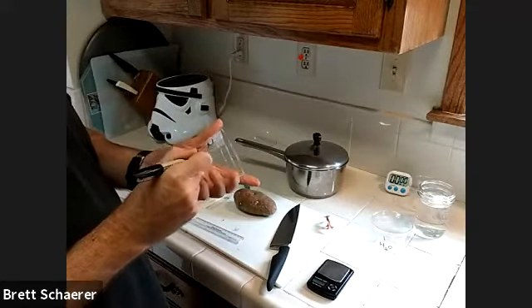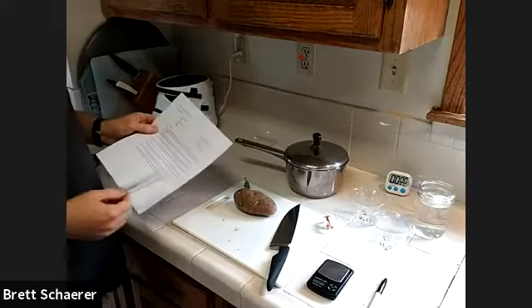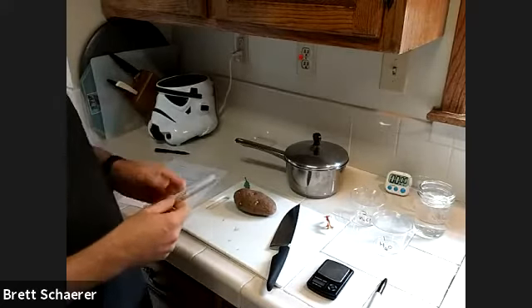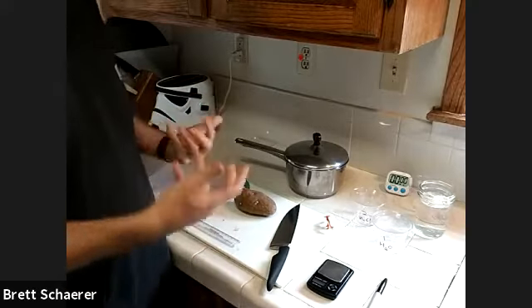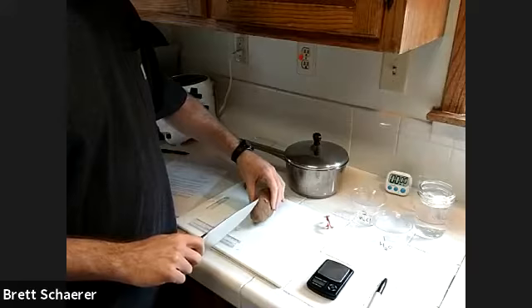And for the potato slices, we want to have slices that are about 7 centimeters long by 1.5 centimeters wide and about 1 centimeter thick. And again, the exact measurements don't matter as long as they're comparable in size and there's enough surface area to actually have some fluid exchange.